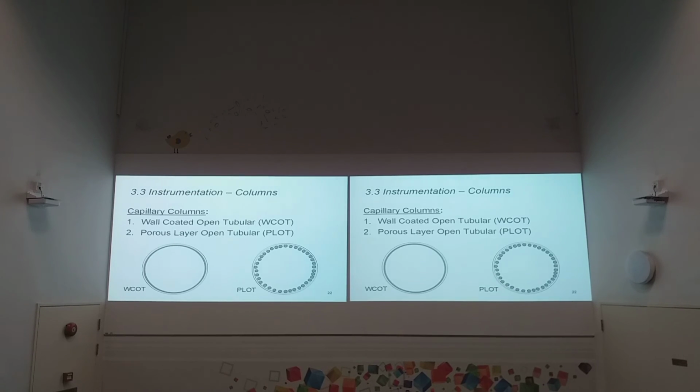Then the capillary column. Now today there are two major different types. One is like in your house, in my house, in this LT, the concrete wall. Usually we paint a layer of chemical. This is called Nippon Paint, right? So in the column, likewise, we apply a special chemical, usually a special solvent. Then we coat the inner surface.